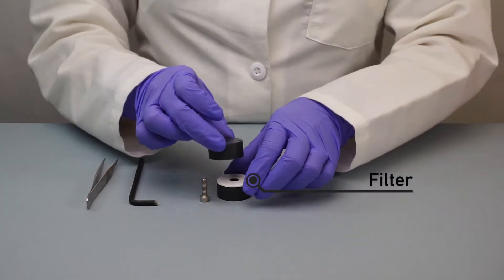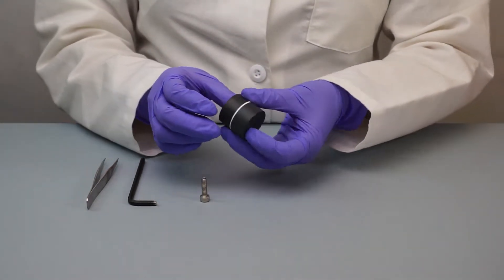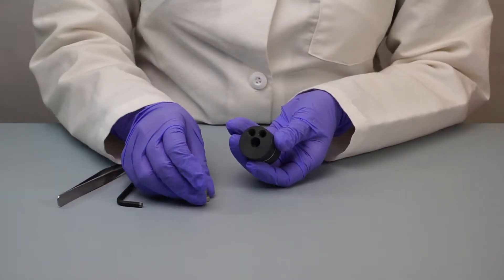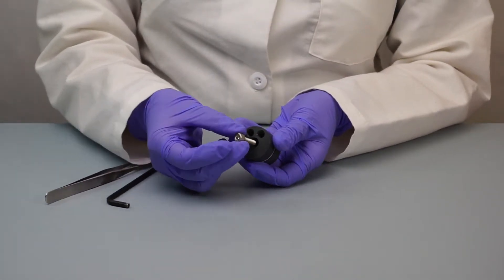To assemble the debubbler, place the filter between the two parts of the housing of the unit and screw them together with the help of an Allen key.